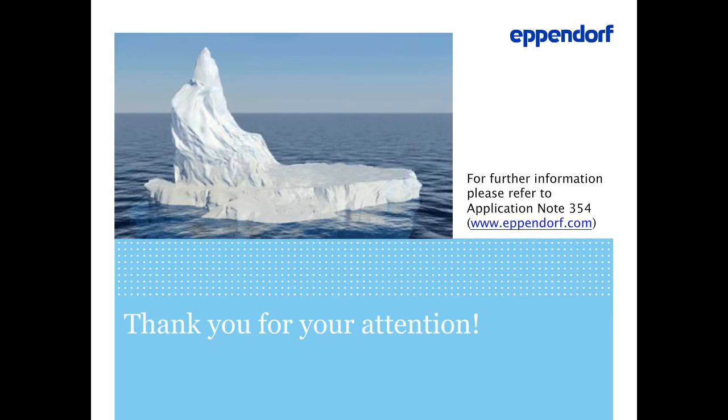So with small volumes I would definitely not work with water, because in a calibration you normally use water. The reason is that the ratio of surface to volume is different in small volume tips than in bigger volume tips. So to summarize that long answer, with bigger volume tips it will probably not make any difference, but with the small volume tips I do not recommend using low retention tips with water.